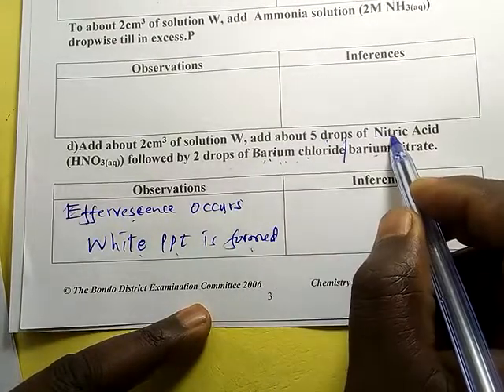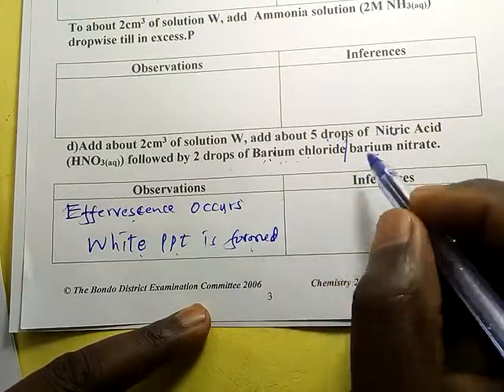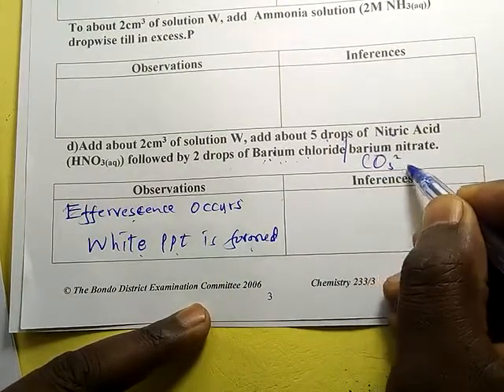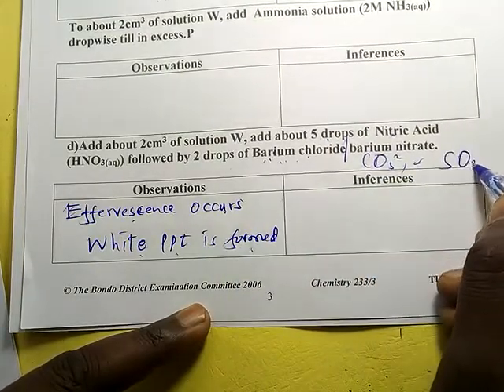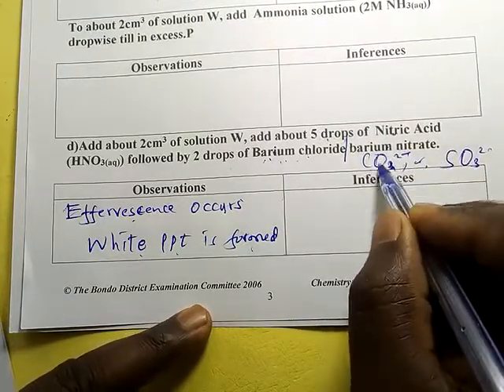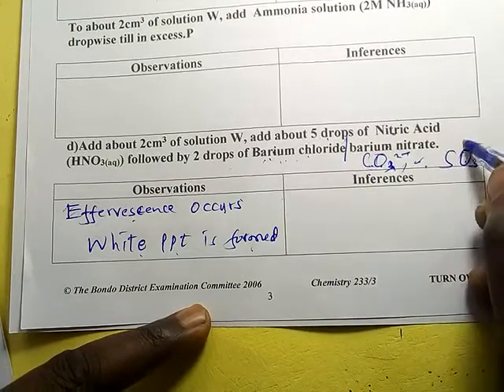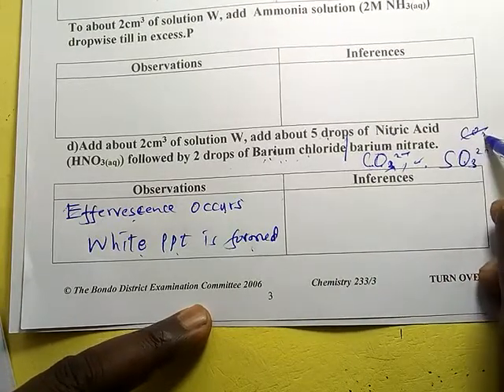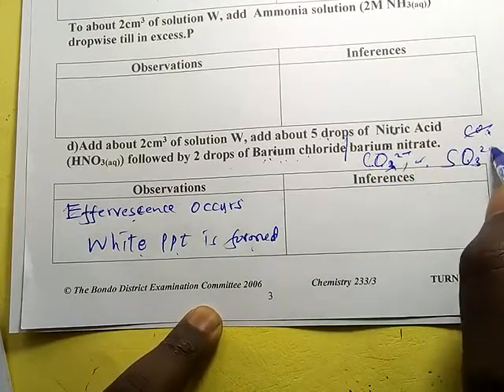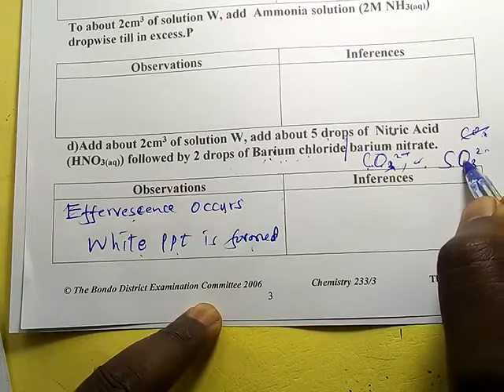The acid reacted with a carbonate or a sulfite, 3 and 3, right? So when the acid is added, it reacts with the carbonate or the sulfite, producing carbon dioxide and the effervescence occurs. So it means the reaction is already over. There is no more carbonate, there is no more sulfite.